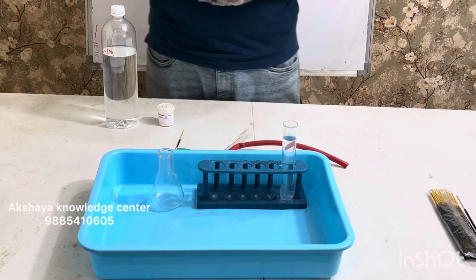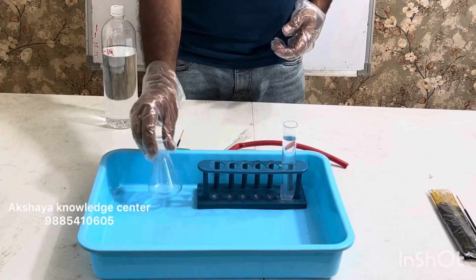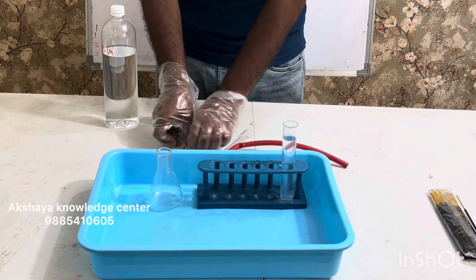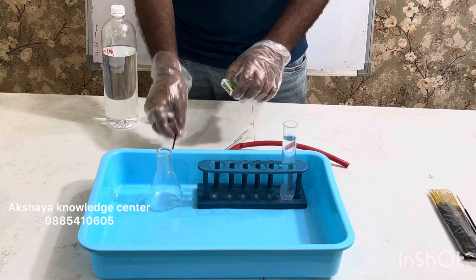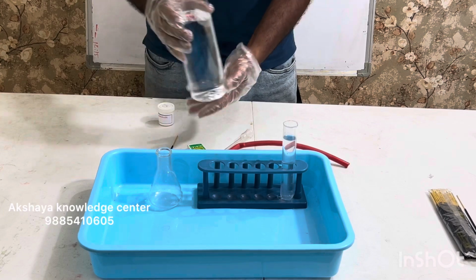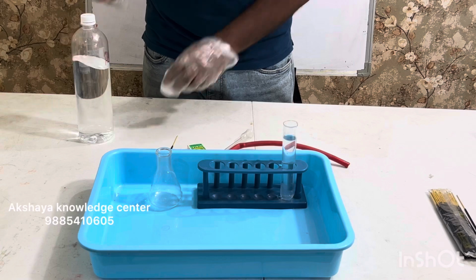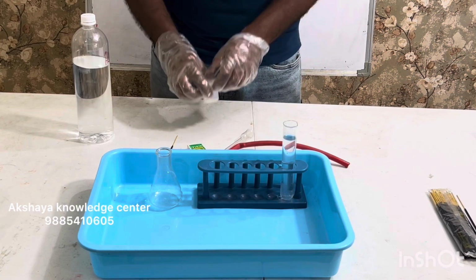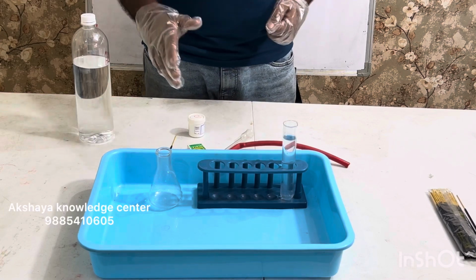Here are the materials required for the experiment. I'm using a conical flask. You can also use a boiling tube or a test tube. Then I have again a matchbox and an incense stick to test the nature of the gas. We used something similar to test the hydrogen gas. Then I have my hydrochloric acid, 3 molar, and then I have carbonate. This is calcium carbonate.